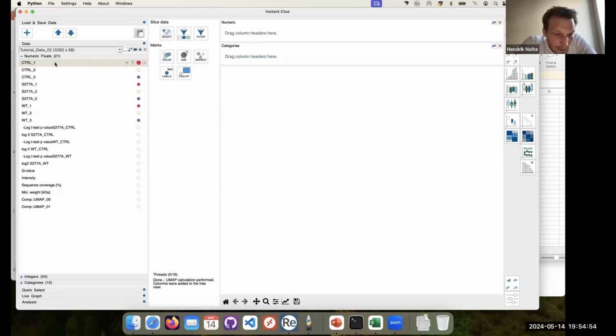It's unrelated, but if you do all this analysis, can you save the pipeline, and then if you replace the data set, all the graphs are automatically generated in the same way? No, sadly not, but I think this is one thing we are trying to do, to save a workflow and then apply it. Exactly. Because sometimes you just change one treatment or one genotype, and then you want the same analysis again. So it would be really good. Yeah, sadly it's not possible at the moment.